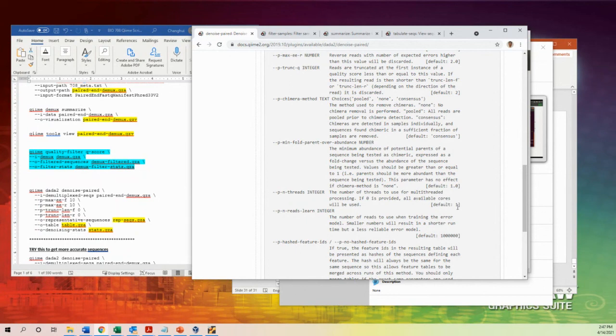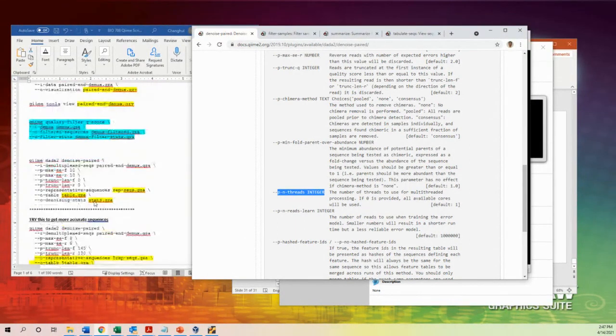The default is 1, meaning the number of threads is 1. If it doesn't work, you put a 0 and see what happened, or go to 2, 3, 4 or 1000. You can change this number to make sure your computer is able to process this command, because it uses a lot of memory and takes 2-3 hours.